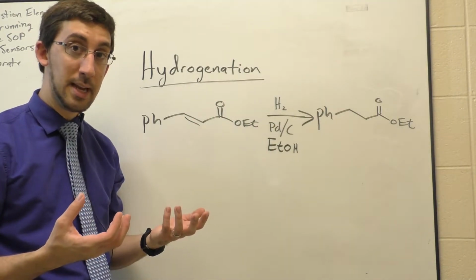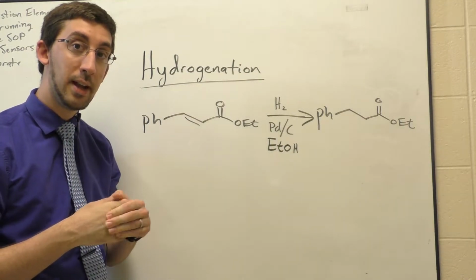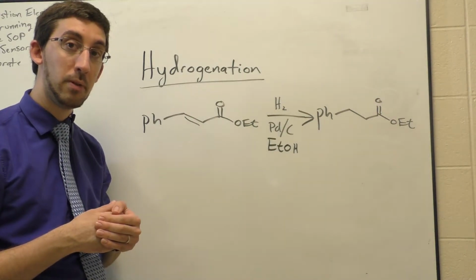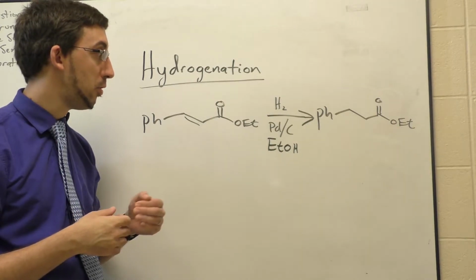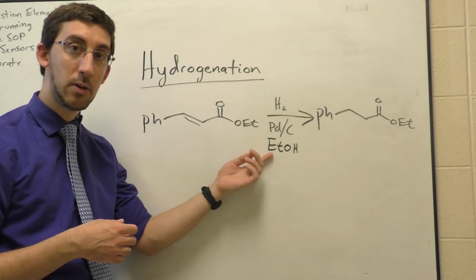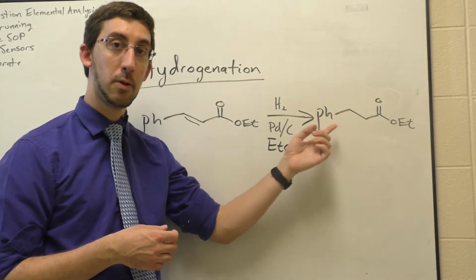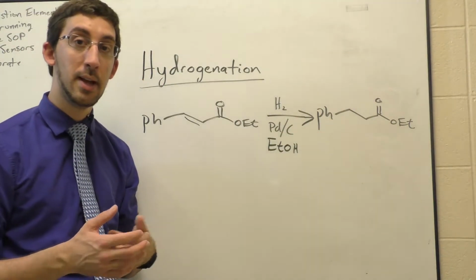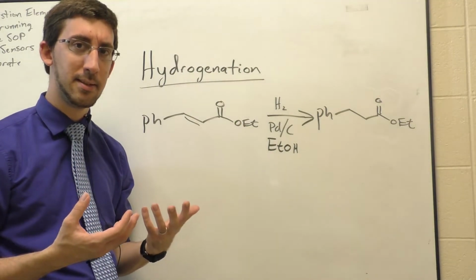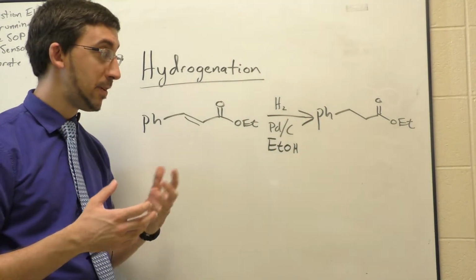All the other thing we need in this reaction is simply the substrate, which in this case is an alkene from a natural product. This is ethyl cinnamate, and it's found in the essential oil of cinnamon. We're going to use H2 with palladium and carbon, and a simple solvent, ethanol. We're going to hydrogenate this alkene down to the alkane to give us ethyl 3-phenylpropionate, which turns out to be another natural product. It's found in muskmelons and in red fermented soybean curds of all places. It's also used in the perfume industry. And it's a very simple reaction.